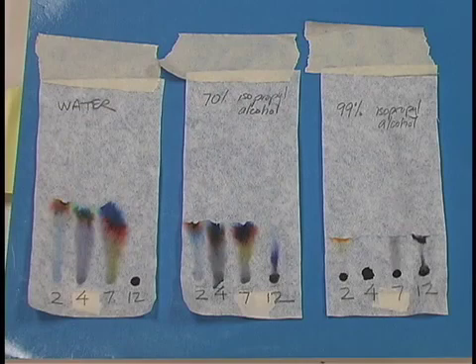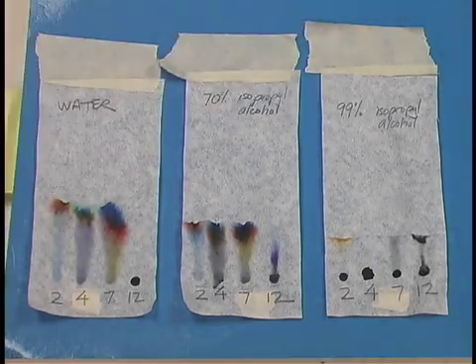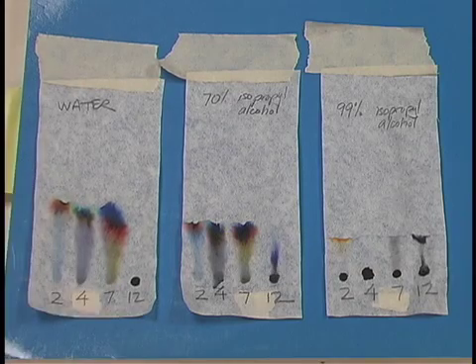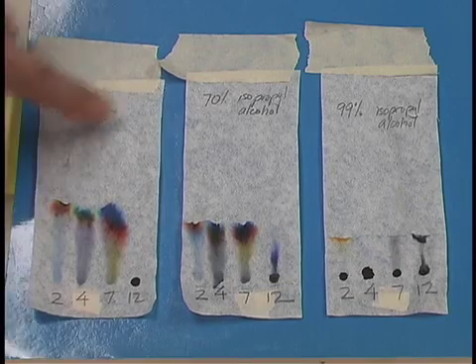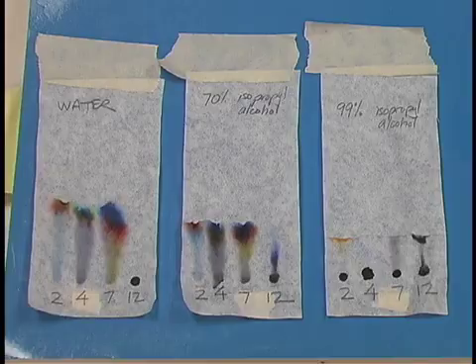Here are some examples — these are the same markers run in the three different solvents: water, 70% isopropyl alcohol, and 99% isopropyl alcohol. It's the same four markers, but you can see how different the chromatograms are. Notice that number 12 in the water didn't run because it's a permanent marker, but it did start to run in the two alcohols. Numbers 2, 4, and 7 are advertised as washable markers, so they work really well in water, mostly well in 70% isopropyl alcohol, and not very well at all in the 99% isopropyl.